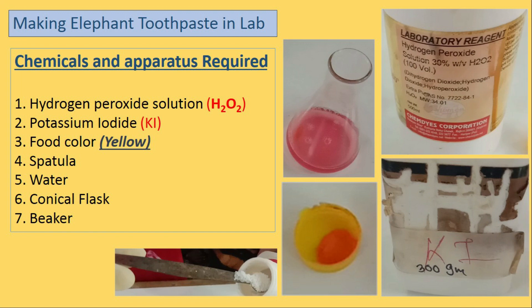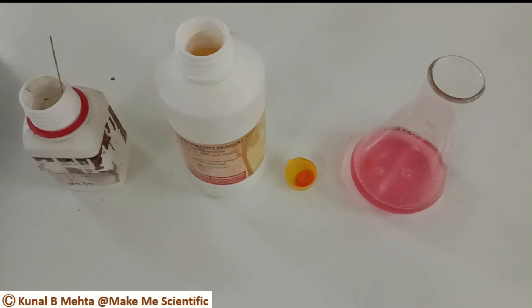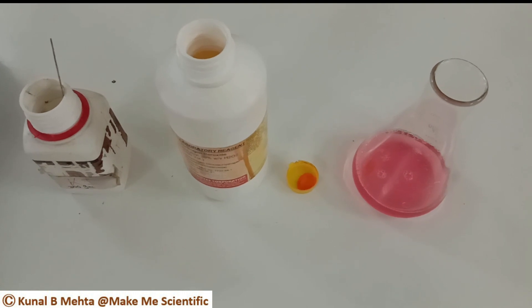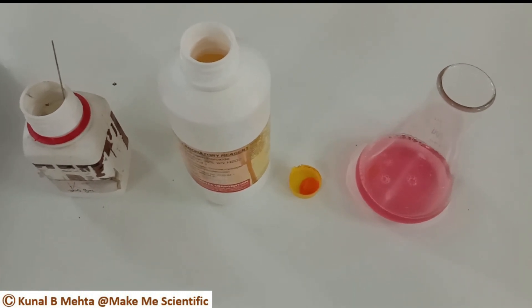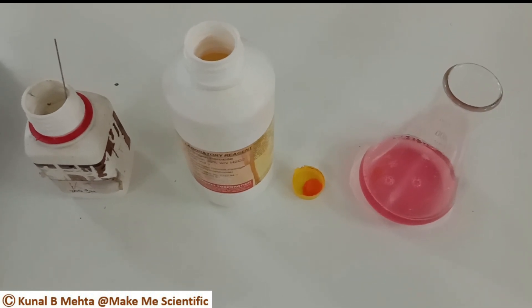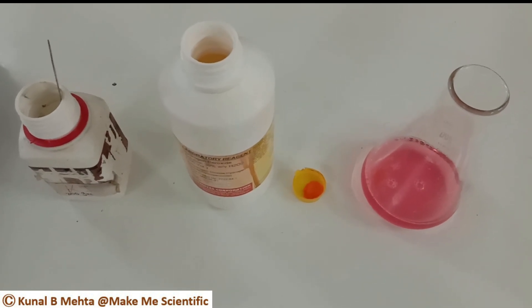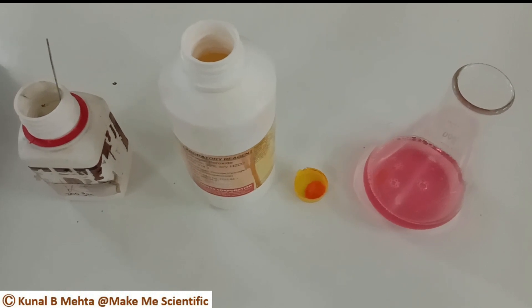Hello scientific audience, I am back with another demonstration in chemistry: how to make elephant toothpaste. Elephant toothpaste is a foamy substance caused by the rapid decomposition of hydrogen peroxide using potassium iodide as a catalyst. How rapidly the reaction proceeds will depend upon the concentration of hydrogen peroxide.